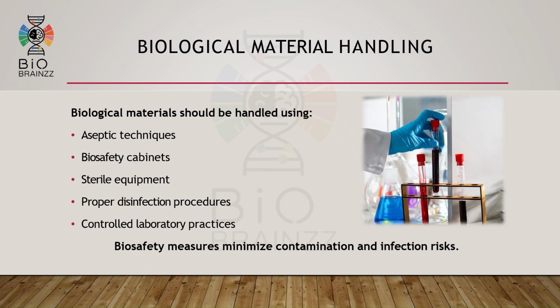Biological materials should always be handled using aseptic techniques to avoid contamination. Biosafety cabinets are commonly used while working with infectious samples. Sterile equipment and proper disinfection procedures are also essential. Controlled laboratory practices help minimize contamination risk and reduce the chance of infection.